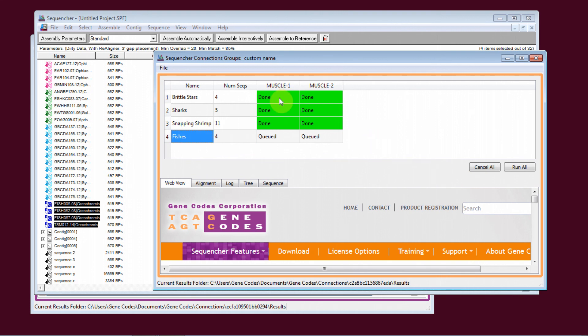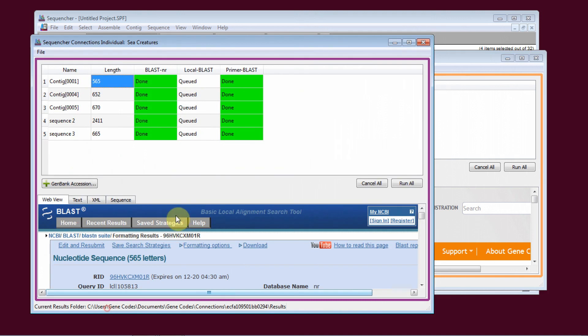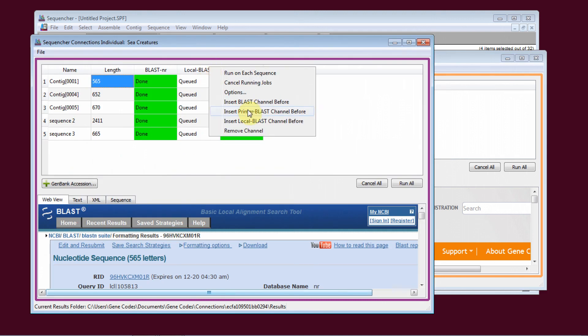In Connection Sessions for individual sequences, there are now more options for adding channels. And you can give each channel a custom name.